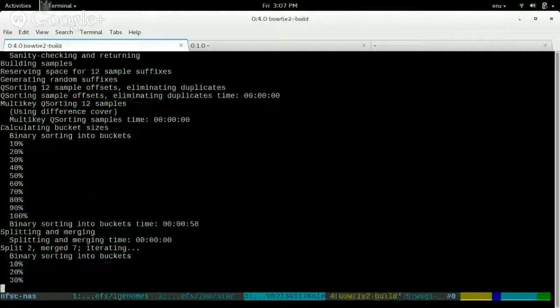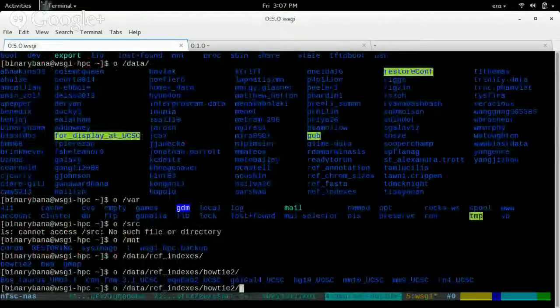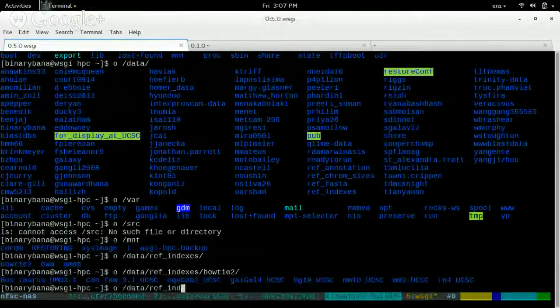Oh, okay, that's still working. What would that be? That would be a maize genome upload? Right. So here, since it's a shared resource, it would be silly for everyone to have a copy of their organism's reference in their home directory, because that would waste a lot of space, since lots of people would have human references, for instance, and the indexes. So he makes those publicly available to everyone.